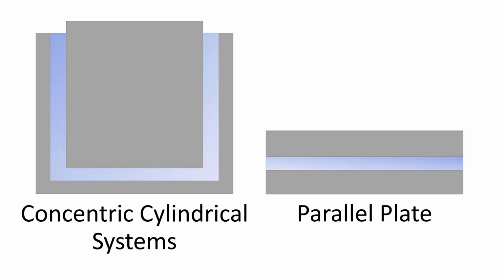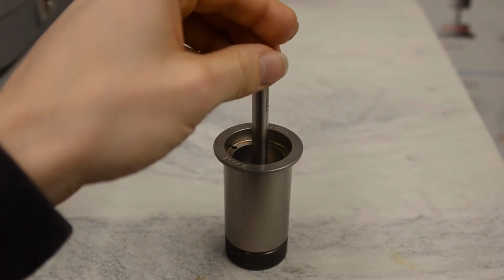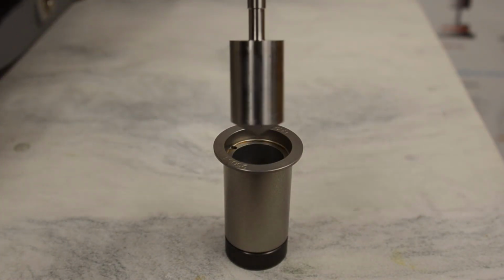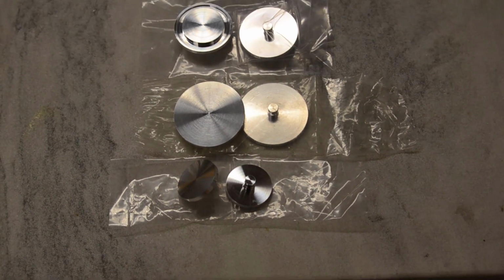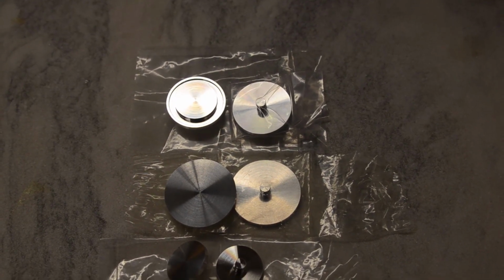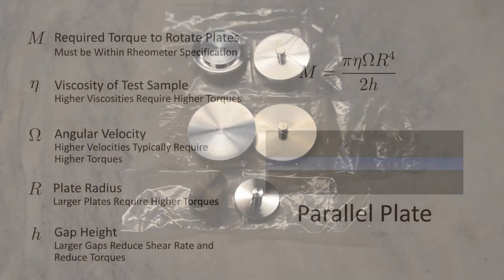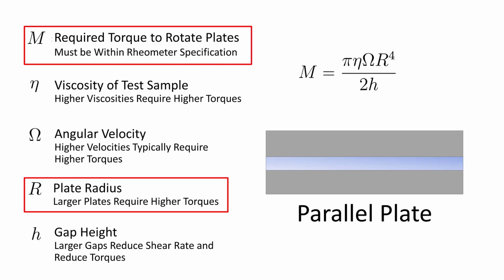Very thin liquids can benefit from systems which shear large areas of sample. Cup and bob systems may produce more precise results when measuring thin liquids as long as a large volume of sample is available. Larger diameter cone plate and parallel plate systems may be desirable as well, with low viscosities to produce measurements using a larger portion of the measurement range of the rheometer. Conversely, high viscosity samples may require small diameter measurement systems to keep the readings within the range of the rheometer.